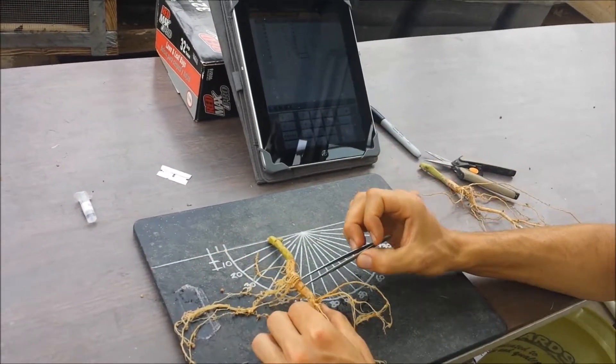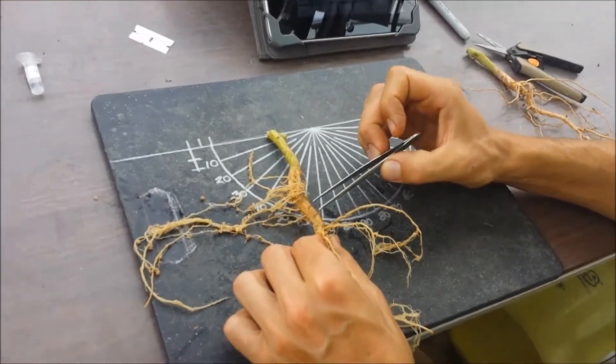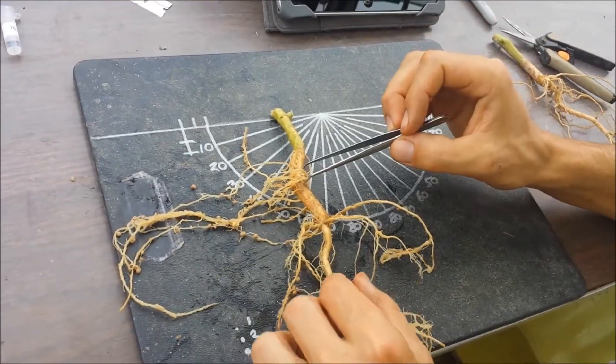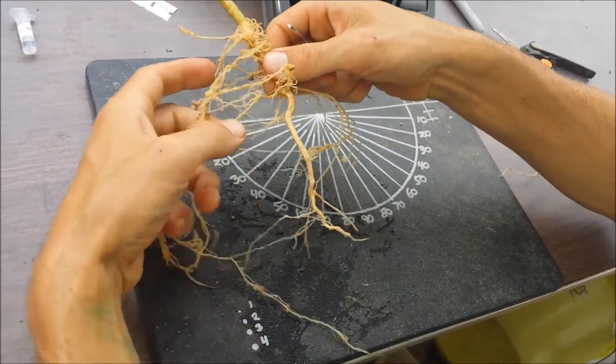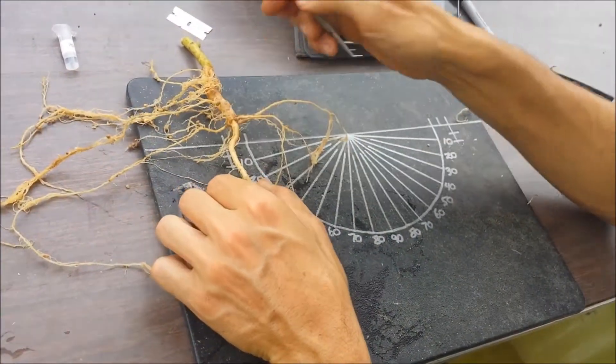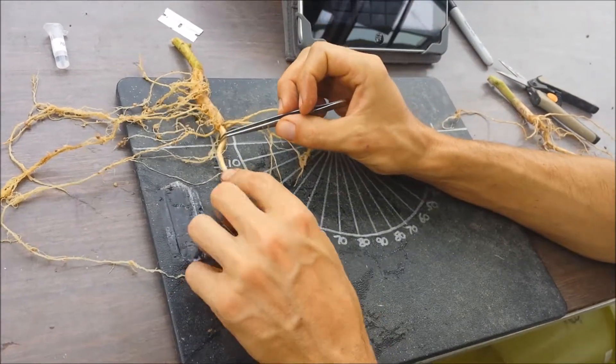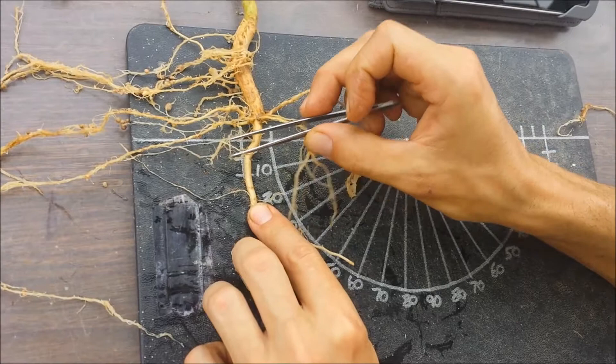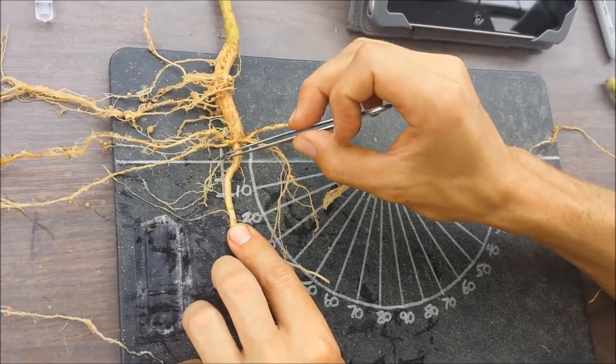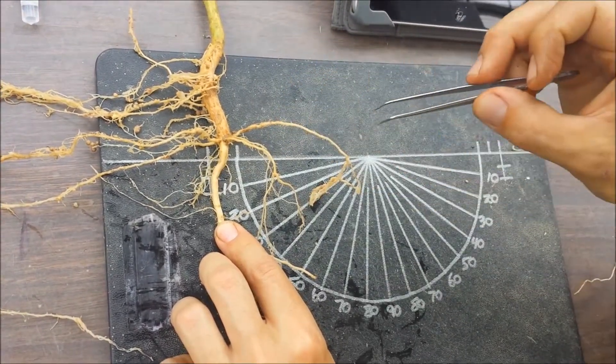Then I would count the number of adventitious roots, which are all the roots there. I might measure taproot branching density. To do that, I would take a representative section of the taproot and count the number of first order laterals in a two centimeter segment. That's why I have these lines marked on the board.